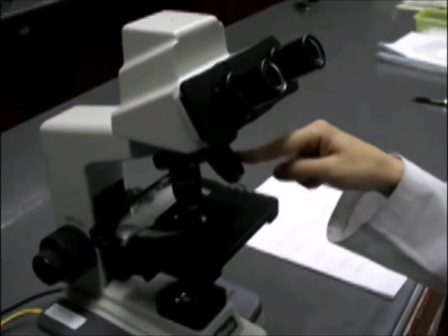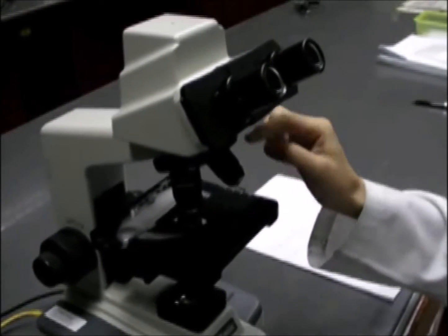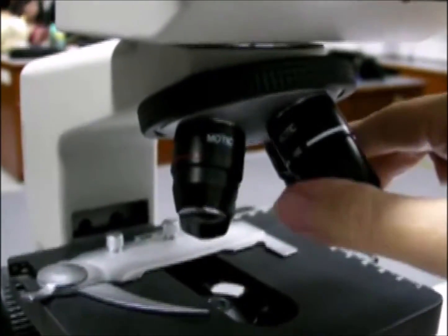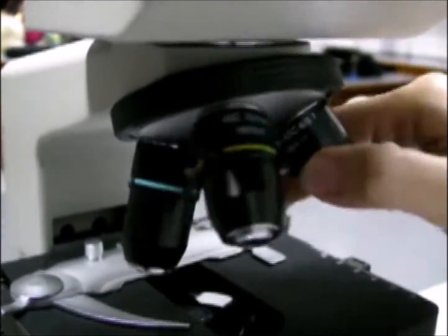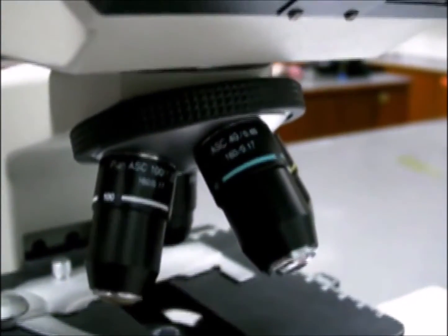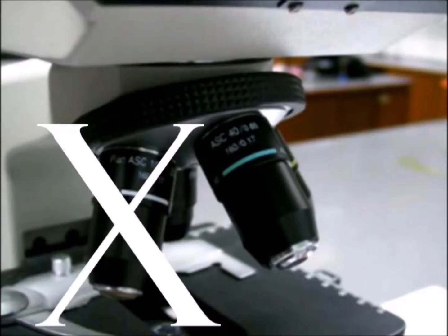These are objective lenses. Each one has a different magnification. The shortest one has the lowest magnification. This is 4 times with a red ring around it. The next high power is 10 times, with a yellow ring around it. Next is 40 times, with a blue ring around it. The longest one has the highest magnification, which is 100 times. You will not use this for the practical in A level and for the examination.